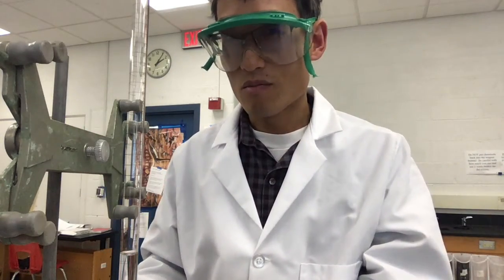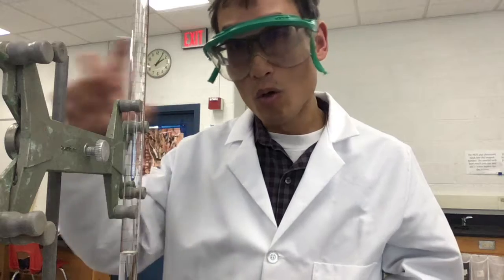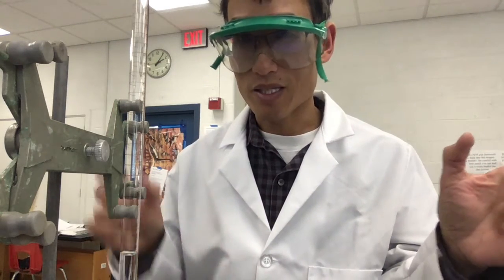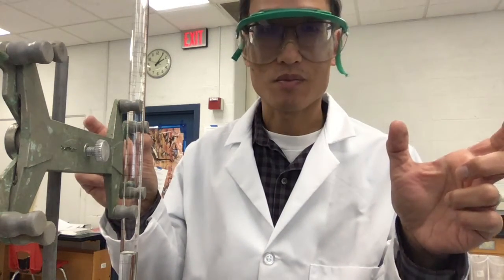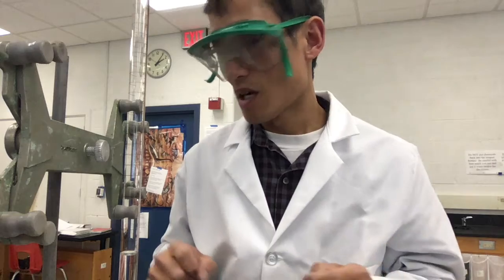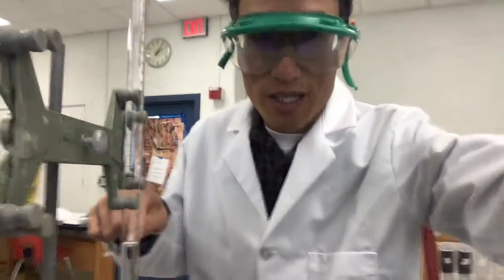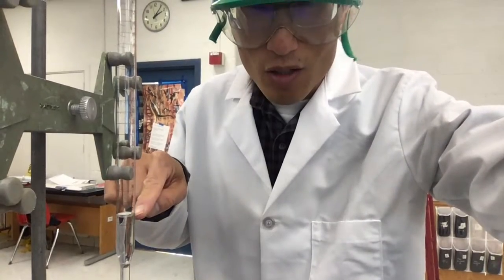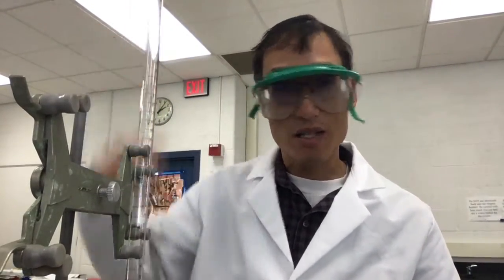The big thing to know about acid-base titrations is that at the end point, the moles of H plus always equal the moles of OH minus. The moles of acid equal the moles of base, for strong acid, strong base. All right, good luck. And if I were to do this over again, I'd have to fill it up again. So you fill it up to whatever, and start over. That's a titration.